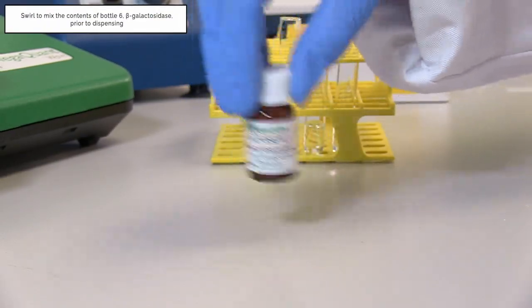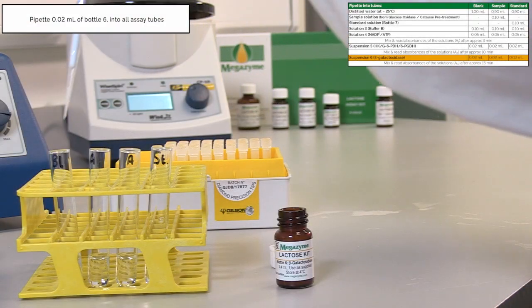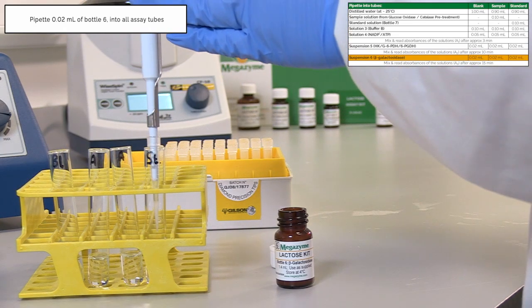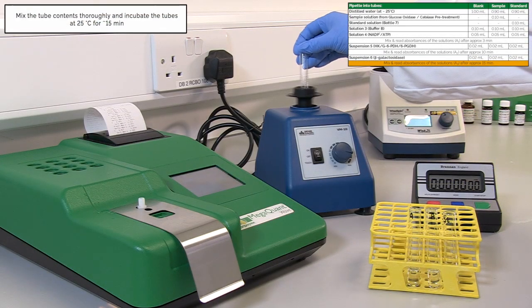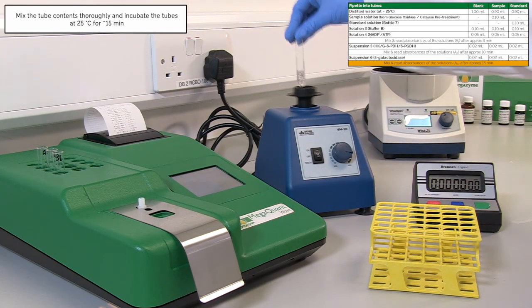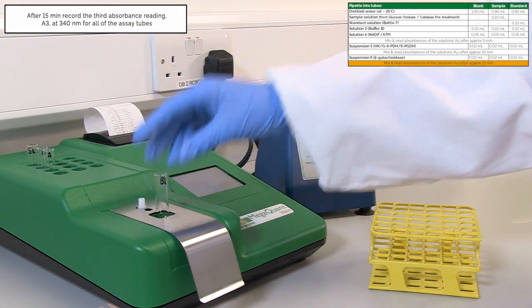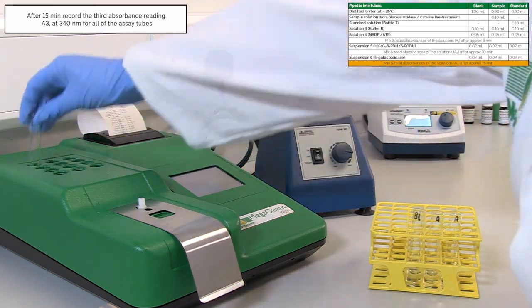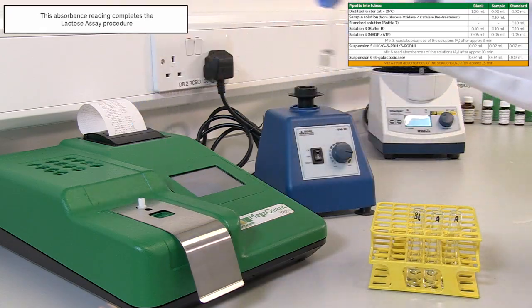Swirl to mix the contents of bottle 6, beta-galactosidase, prior to dispensing. Pipette 0.02 milliliters of bottle 6 into all assay tubes. Mix the tube contents thoroughly and incubate the tubes at 25 degrees Celsius for approximately 15 minutes. After 15 minutes, record the third absorbance reading, A3, at 340 nanometers for all of the assay tubes. This absorbance reading completes the lactose assay procedure.